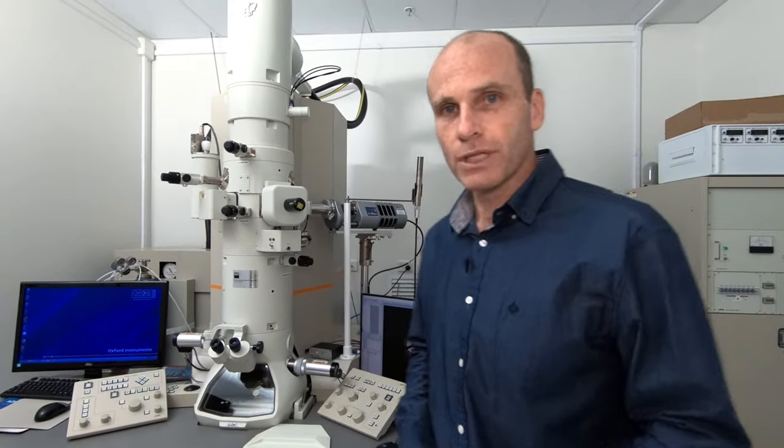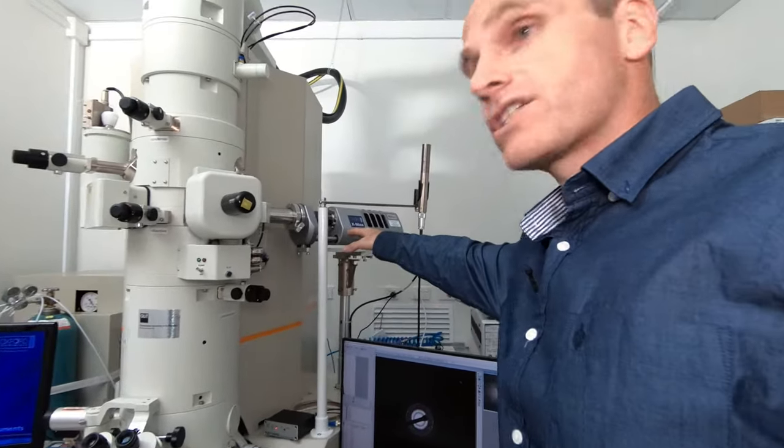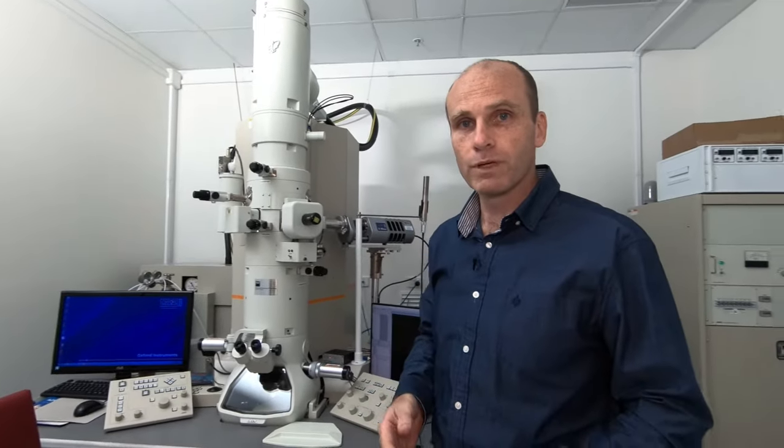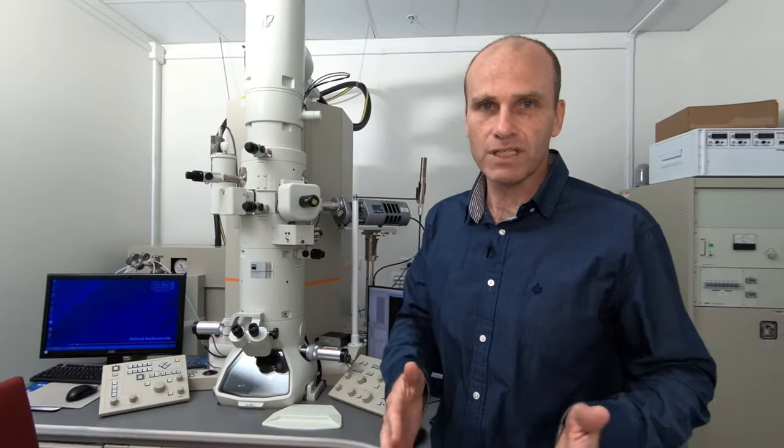There's another type of detector that we can use on our microscope, which we haven't used today and we don't really need it for today's experiment. But it's very useful for a lot of other experiments. And that's the energy dispersive X-ray spectrometer. So that's the instrument that you can see over here, which is attached to the microscope. And this one allows us to get the energy of the X-rays that are given off when the sample is illuminated with electrons. And this is important because these are like a fingerprint for the sample. We can tell what type of elements are present. And we can also condense our beam and scan it across the sample so we can work out the spatial distribution of the elements. And we can see where the gold is in our sample and where the gallium is, if there's any there. In this case, we know that we've synthesized gold nanoparticles, so that's all we're going to see. So there's not really any value in using it today. But it's an important tool which you should keep in mind for future experiments.